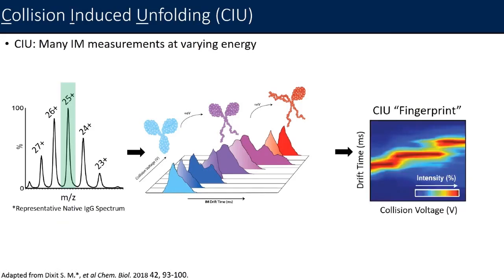So the basic idea here is that the pattern of states that you record in these experiments can be diagnostic for the beginning structural states that we have in the start of the experiment. My group has developed software approaches that we can use to probe this data quantitatively to a level of precision that allows us to make, I think, really deep and meaningful conclusions about the structural states of these proteins, especially for biotherapeutics, which is going to be our focus for today.